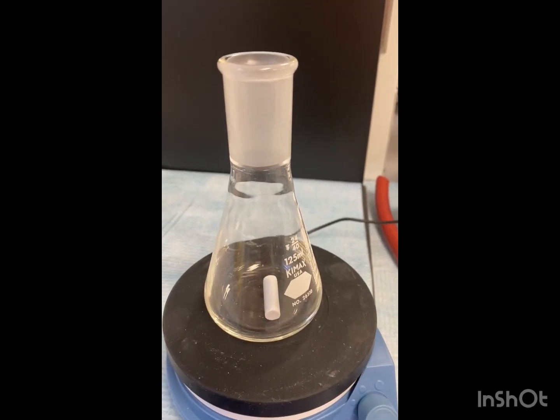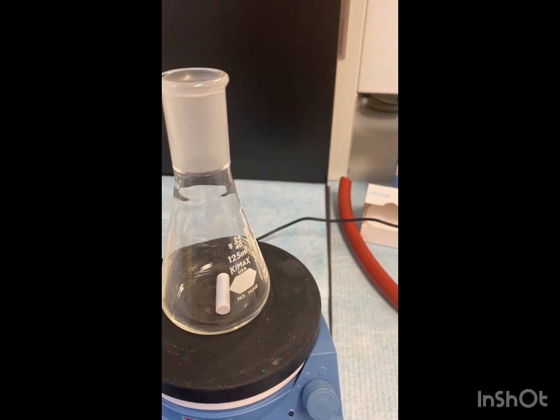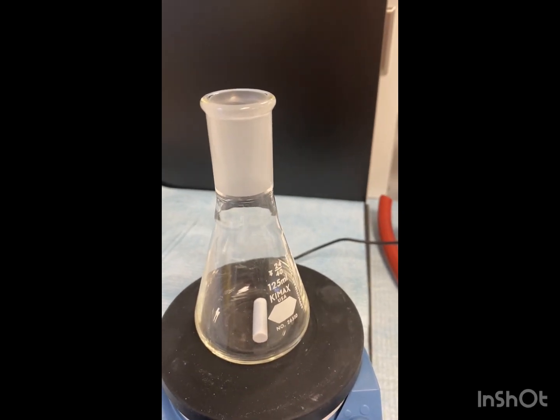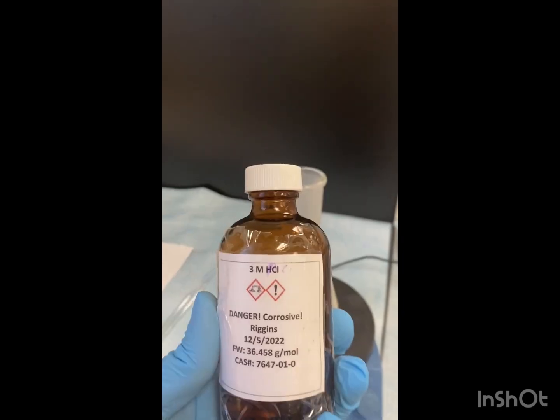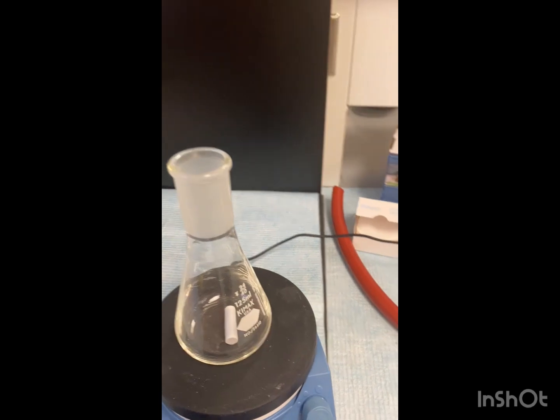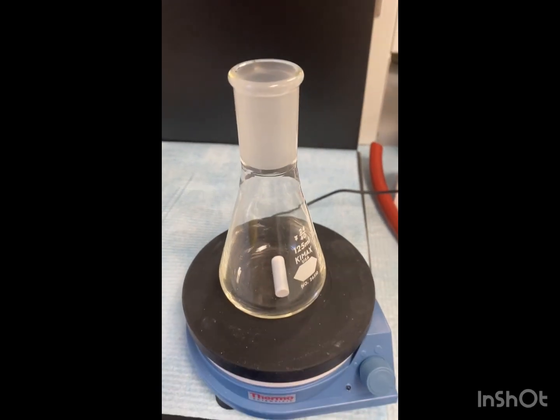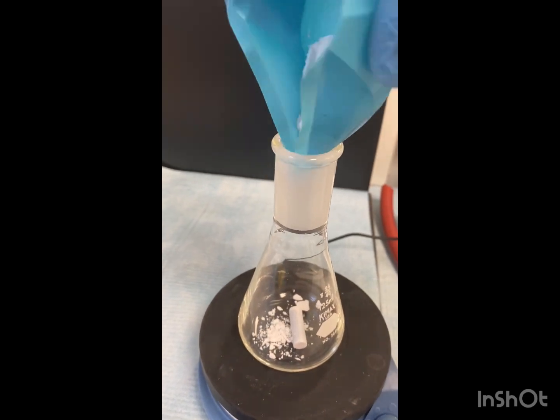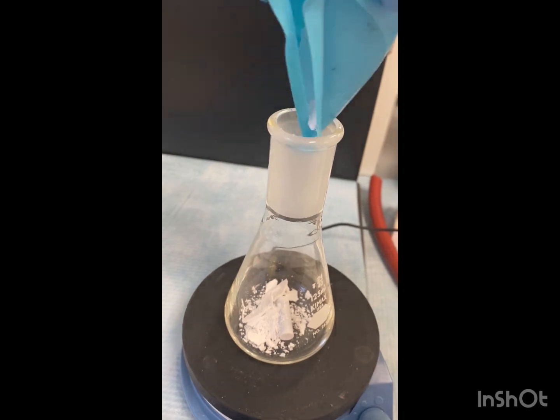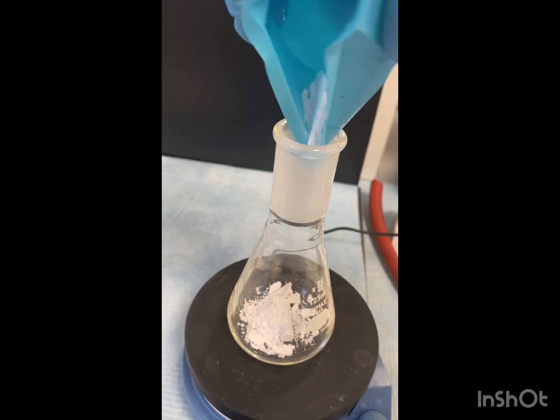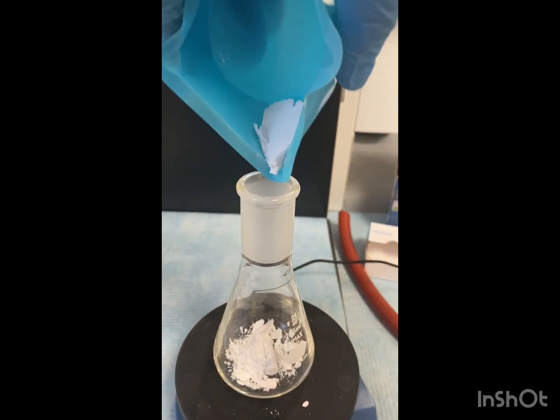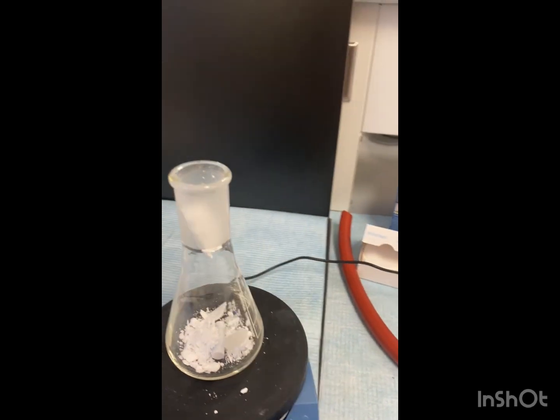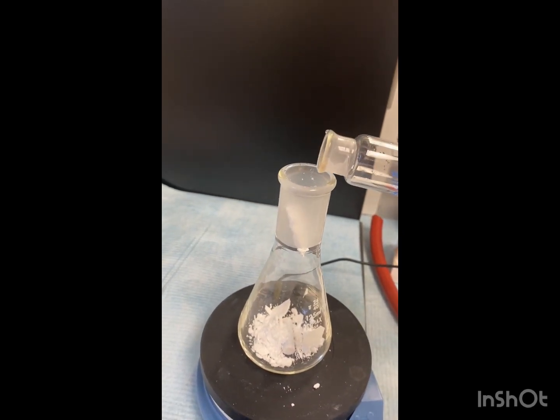Here we have our 125 milliliter Erlenmeyer flask. We're going to transfer our solid into this. Notice I added a stir bar, because we're going to be mixing this with 25 mils of three molar hydrochloric acid. So mixing it with this. Just be extremely careful because the HCl is very corrosive. So we're going to add our solid.